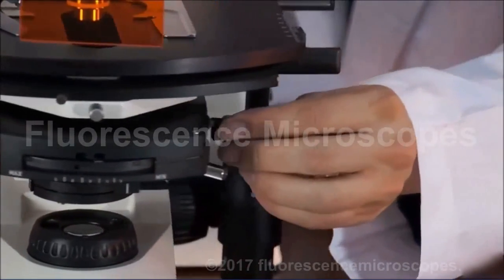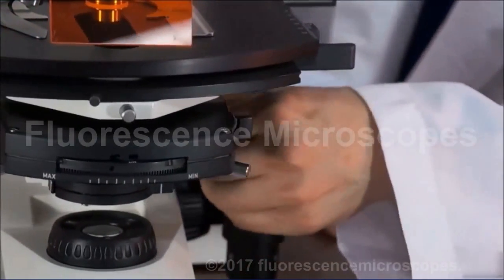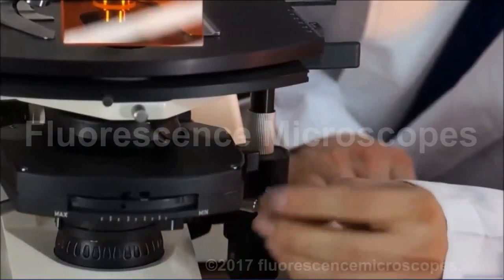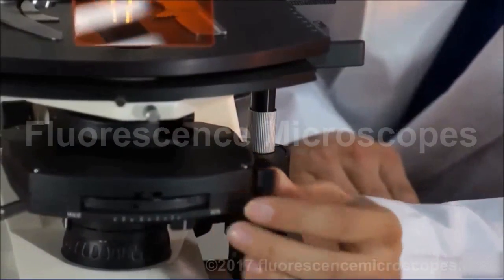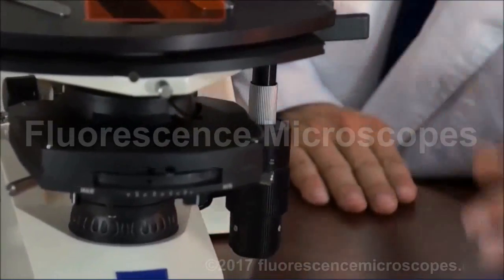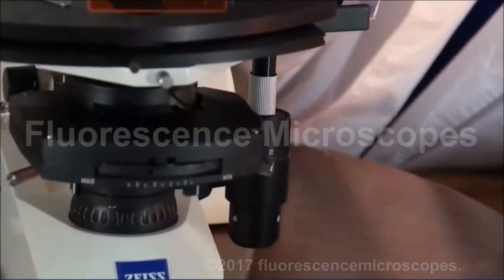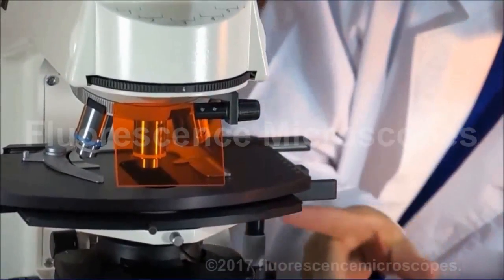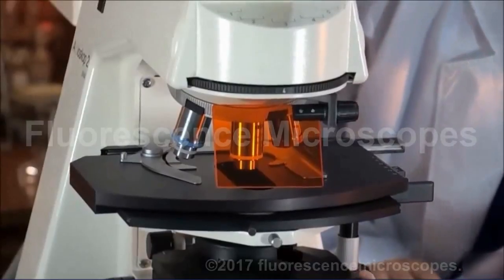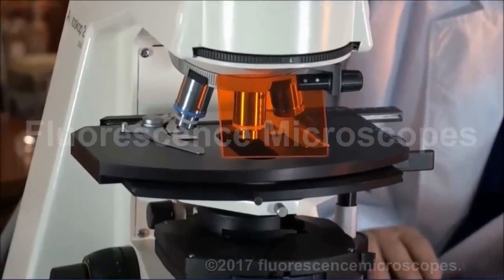And you have a flip out top lens. I'll rack the condenser down. Maybe you can see that top lens engaging and disengaging. There it's engaging and there it's disengaging. When you're using a low power objective like a 5x or a 2.5x, definitely for a 2.5x, you've got to disengage that top lens. The others, you want to engage it.